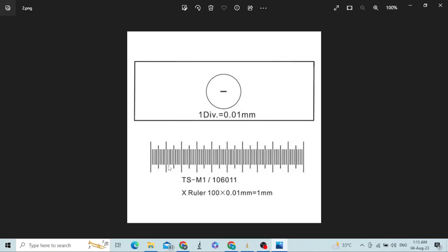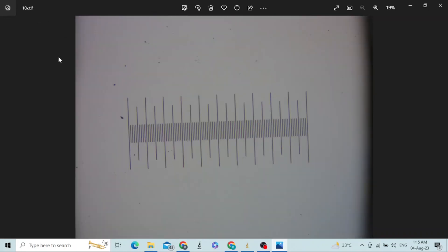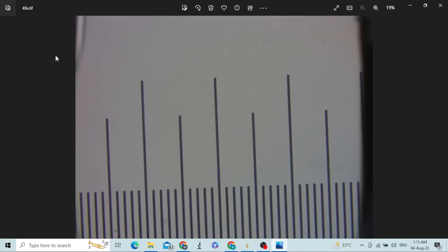I have some pictures of the stage micrometer which I took a while ago. You can see the stage micrometer — this picture was taken at 4x, this is another picture taken at 10x, and another picture was also taken at different magnification.